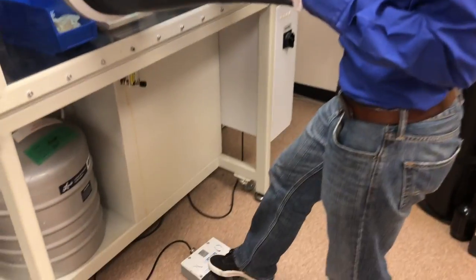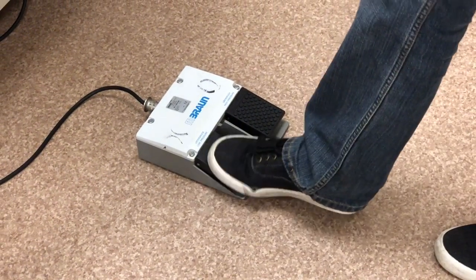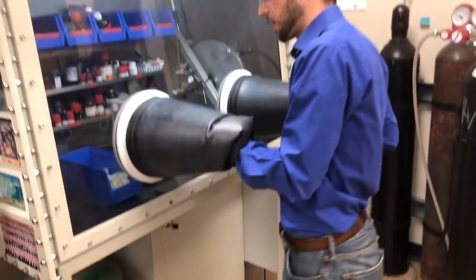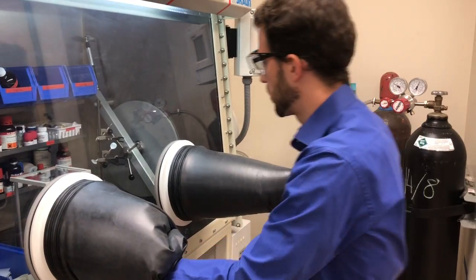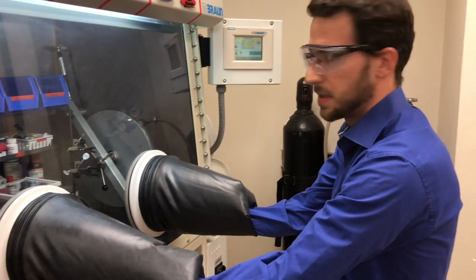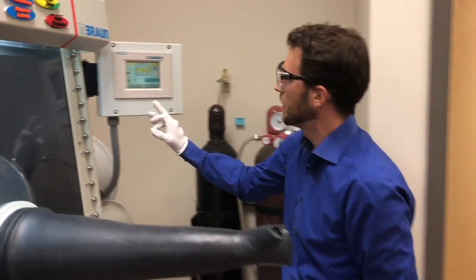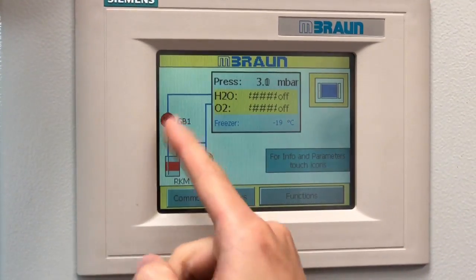When you go in, you can use this foot pedal. It has a hook in the middle so that you can move it around. Press the left pedal — this lowers the pressure in the glove box. If you go in too quickly, you will hear a loud noise, which means the circulation in the glove box has turned off. We can see that something has become red, and red is not good.